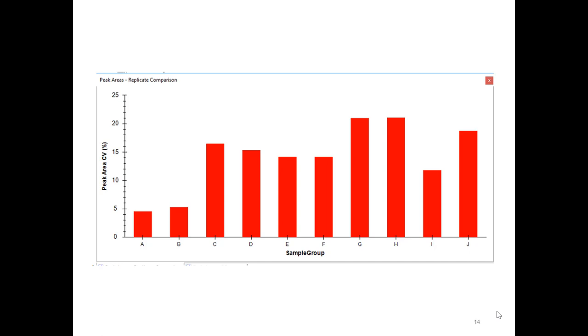Yeah, it does break down. I mean, none of these methods are perfect, right? So this is kind of an example where I'm really accurately measuring the background. Because you can tell over here, whatever my noise is, I'm actually doing a pretty good job of measuring the noise. So I guess, not to beat that horse, we'll stop the comments after this last comment. But it's totally fine.